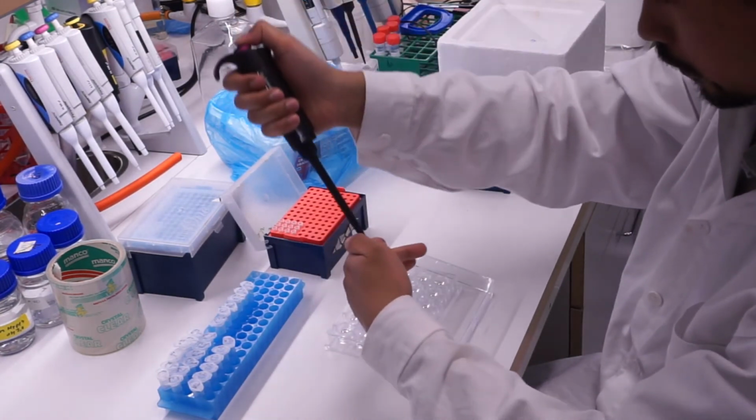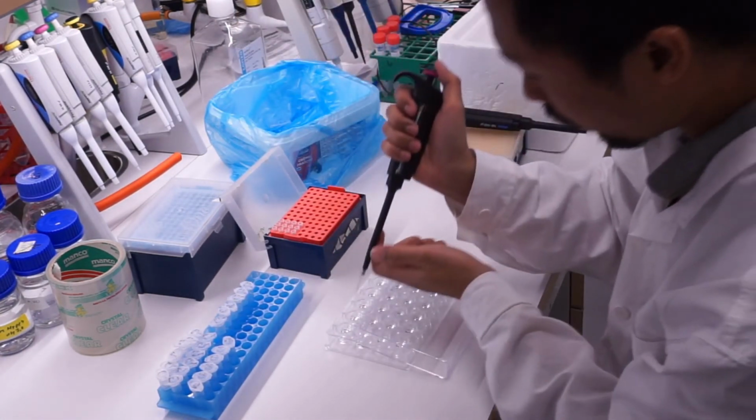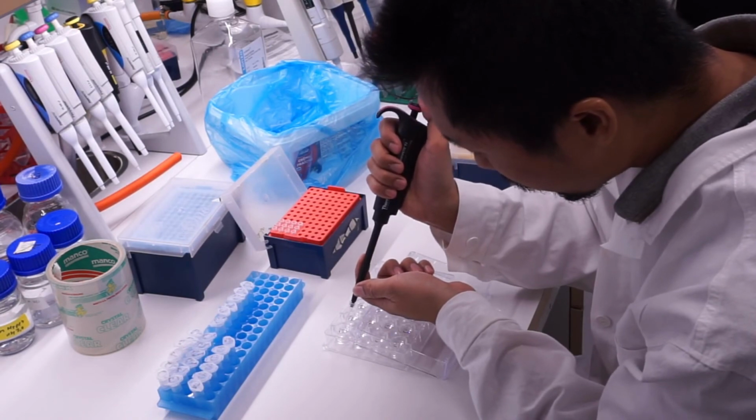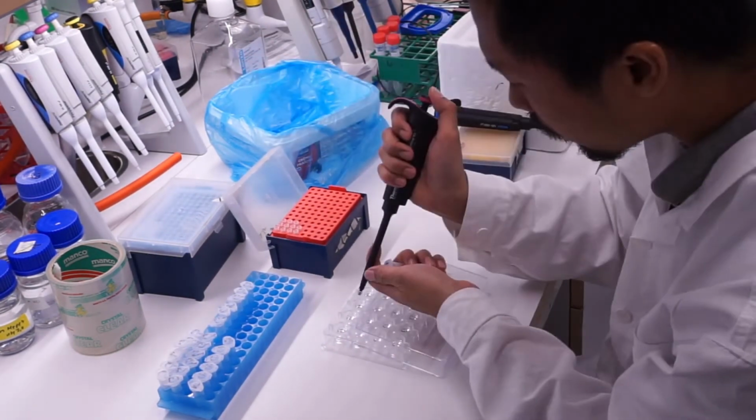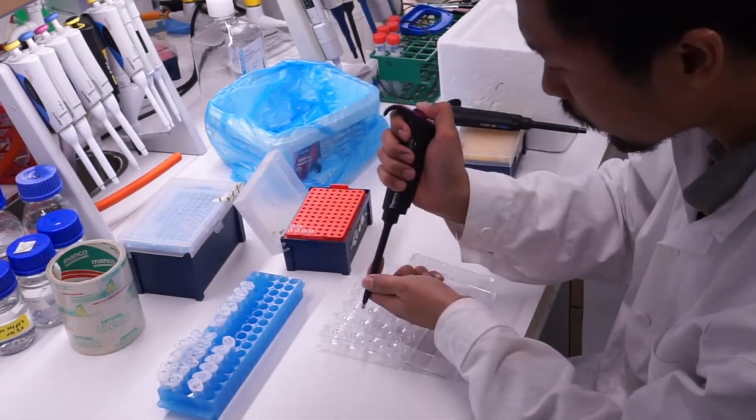Put 1 microliter aliquots of protein solution on the drop wells. Repeat for all wells so that reservoirs are complete.